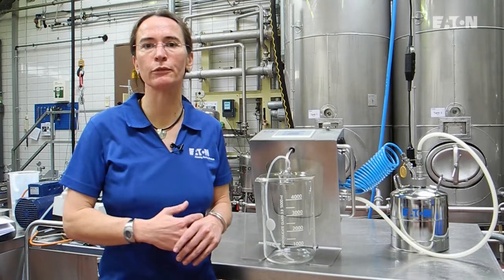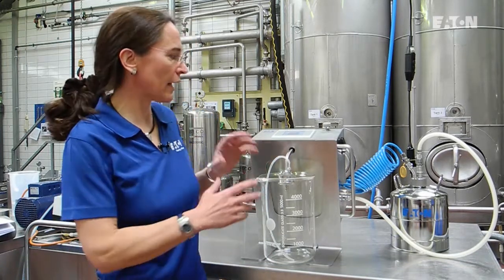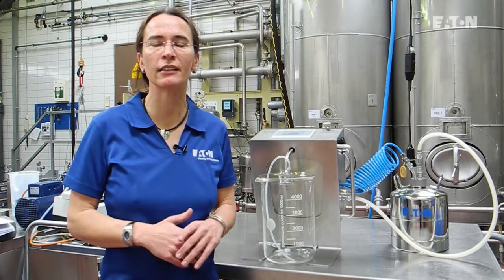Hello, my name is Dr. Ilona Schneider, working at Eaton Technologies in Germany. I'm working as a professional enologist, but also in beverage treatment products. Today we will have a small overview on equipment called filterability test via index measurement for beverages.